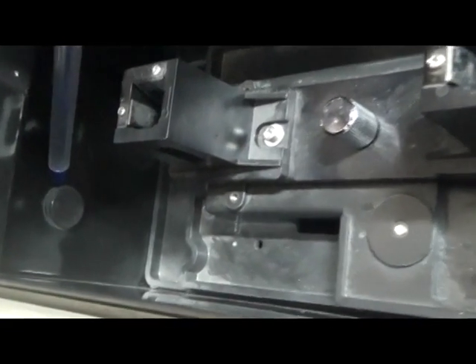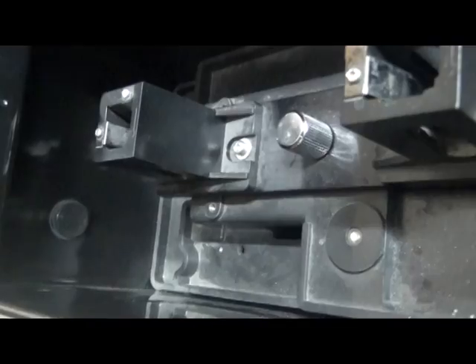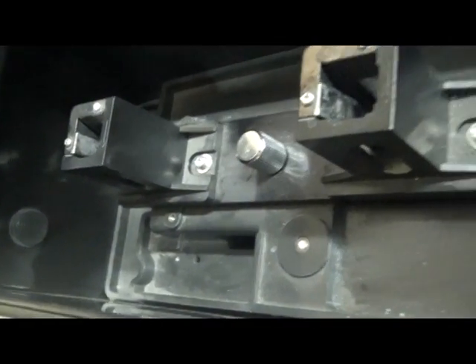This is called the multi-cell holder drive connector. This is the connector for driving the optional multi-cell holder accessories. This is all about the sample compartment.